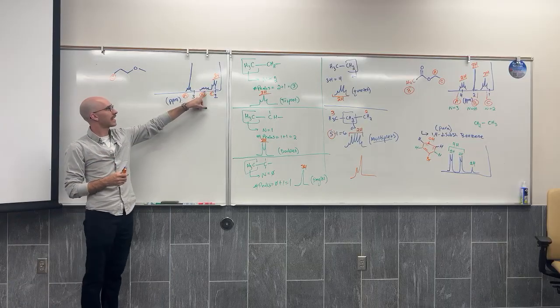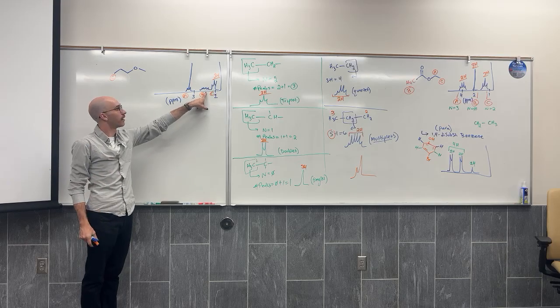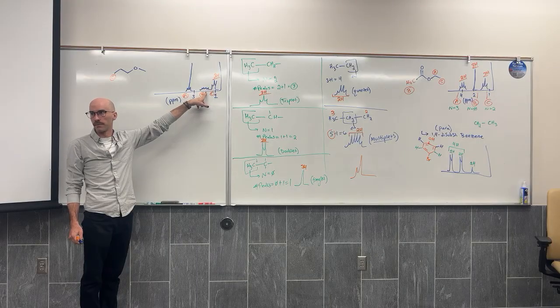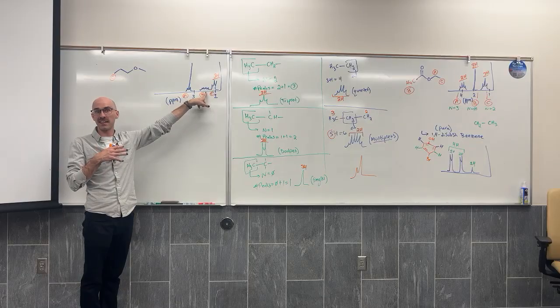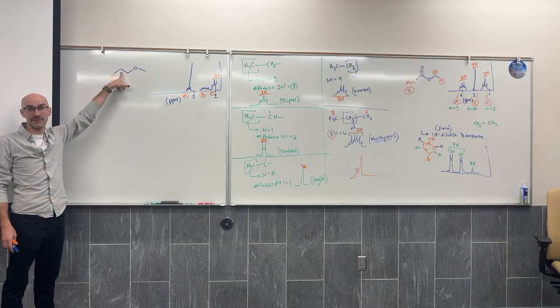What about the second most alkane type region? How many neighbors does it have? A lot. 5. Maybe 5? Yeah, if there's 6 peaks in there, then it has 5 neighbors. So it should be the second carbon. Only this has 5 neighbors.